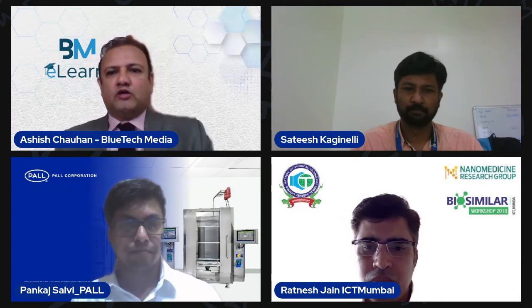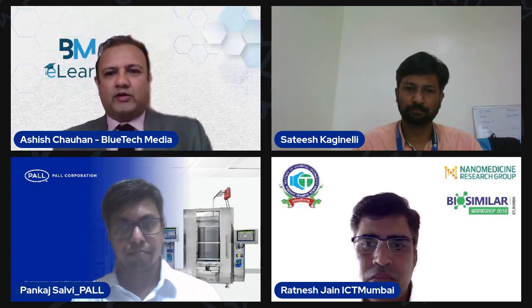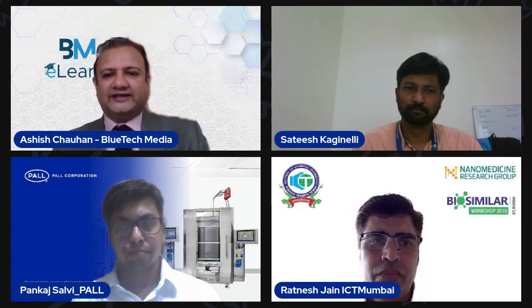Thank you. Our next question is for Dr. Jain. We are working on a metabolite using recombinant E. coli. Our question is, for large-scale bacterial culture, if we want to change the defined media in between the experiment, for example, supplement of substrates, can we install a microfilter?